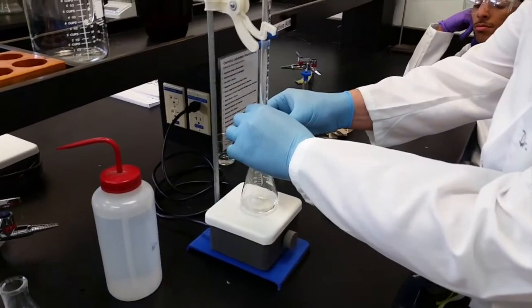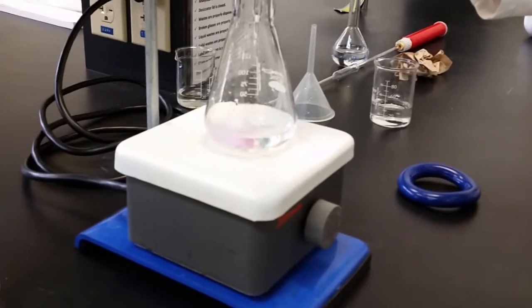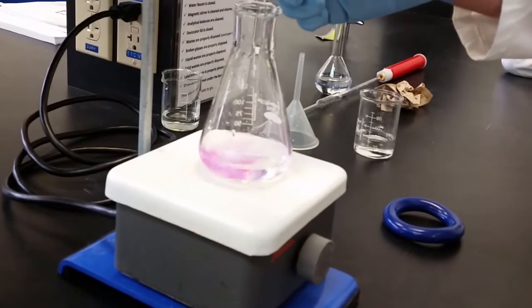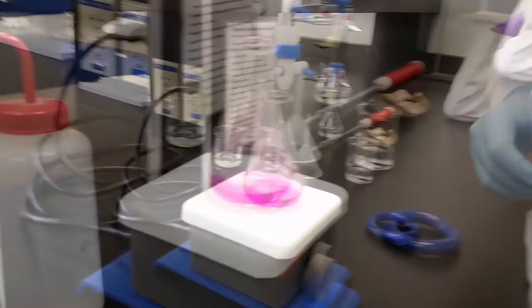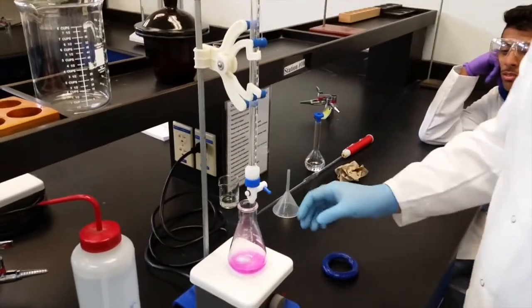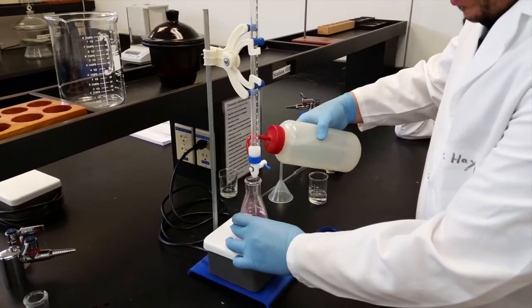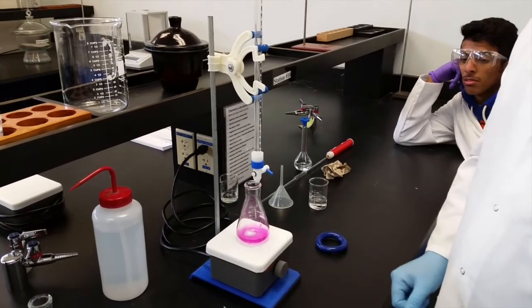Okay? Now I will be adding dropwise. And I will hold the burette. Once I see the color persists, so it doesn't change, I will stop my addition. There you go. So I'm at 1 drop, which means my error will be very small.